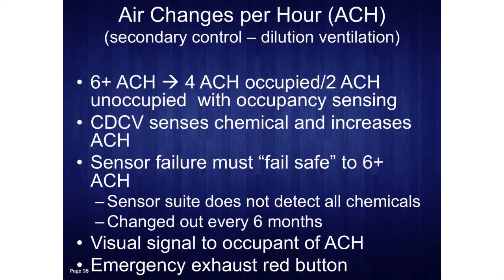So hopefully it's not too long before we find out if there is a problem with the sensors, which usually there isn't anyway. And we have other safety features such as the red button and also visual displays to enable the lab occupants to know what's going on in their labs.